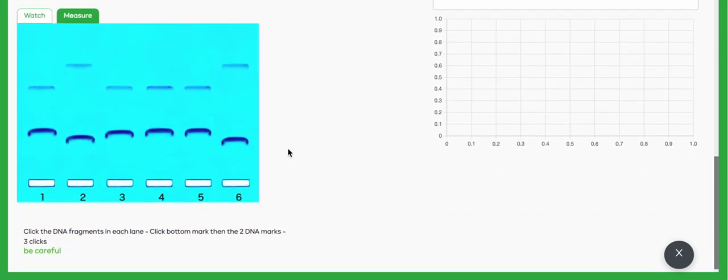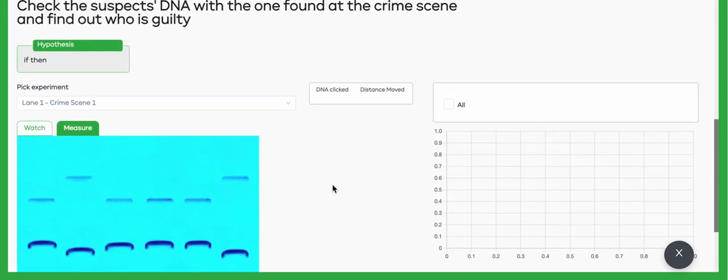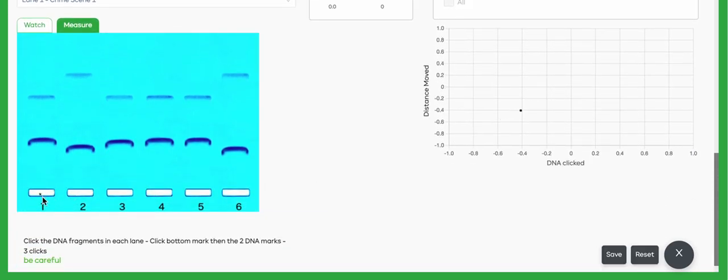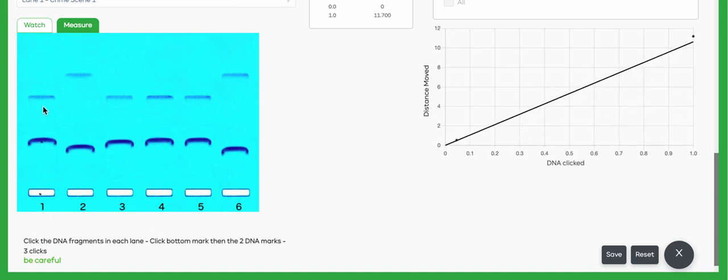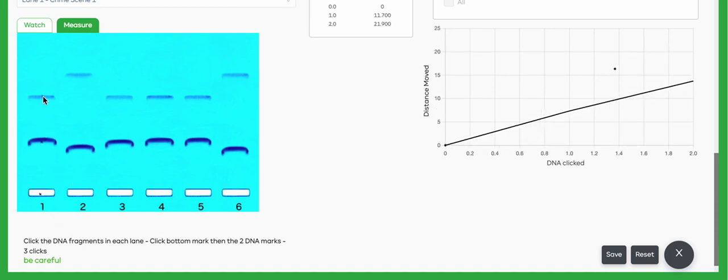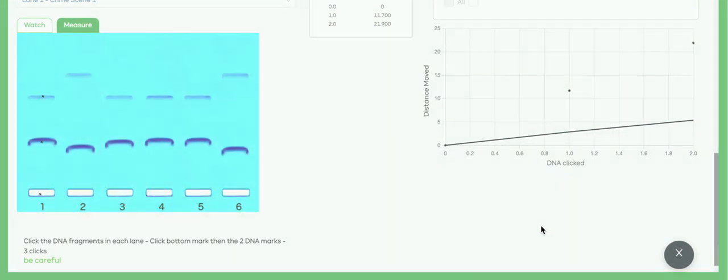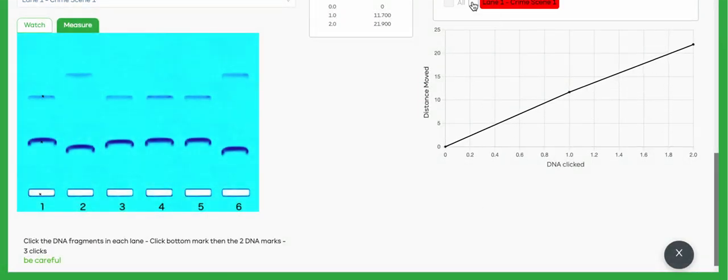Now it says here, click the DNA fragments in each lane. Click the bottom mark and then the two DNA marks—three clicks. Be careful. So we're in lane one, that's over here on the left. First is that bottom mark, and then the two other marks. This is going to create on our graph basically three points: a zero point, the first point, and the second point. So you're going to save that, get it up into your list here.